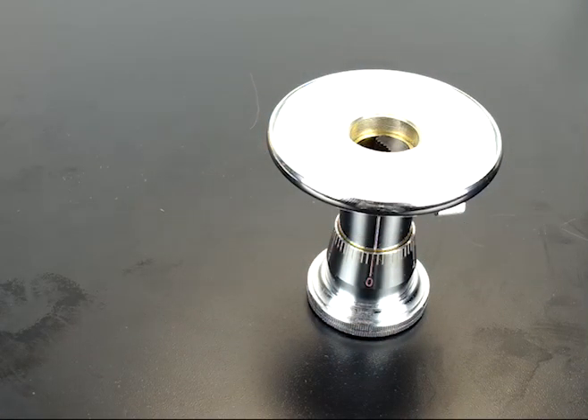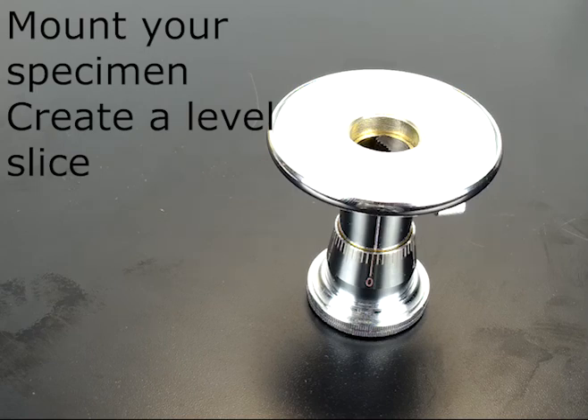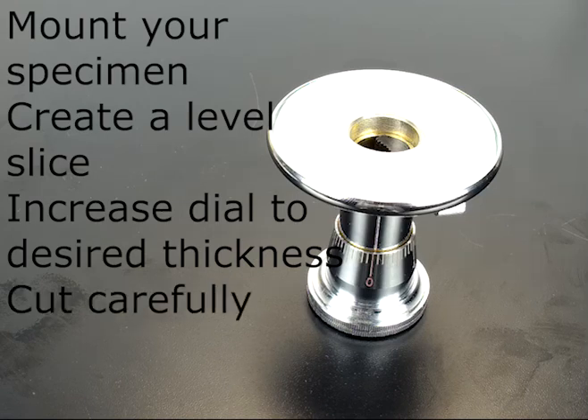There are just a few simple steps to use this apparatus. First, mount your specimen, lock it in place, create a level plane, then increase the central piston until you have your desired thickness, and then carefully cut your final thin section.